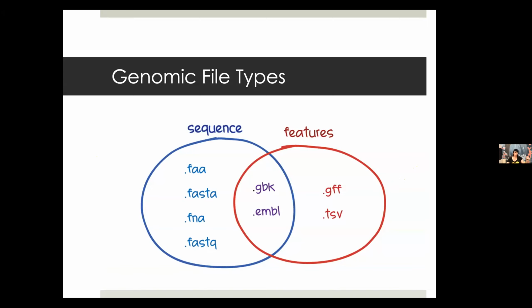I'm going to be starting with a FASTA file, which is the go-to file that contains sequence. And my idea is to get a features file, which will contain the genes themselves. And ideally, I want them blended together in a GenBank file, which is a middle.